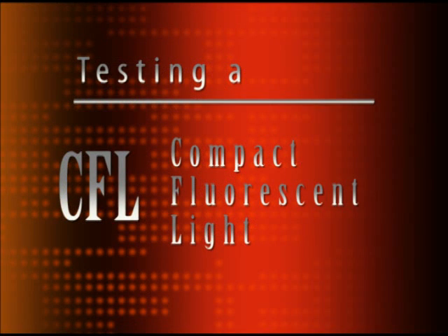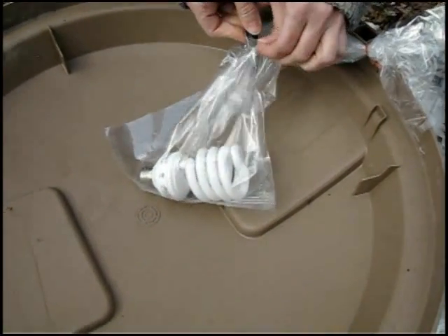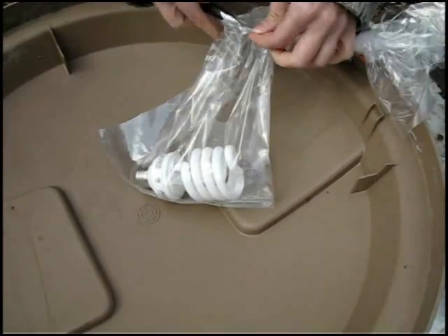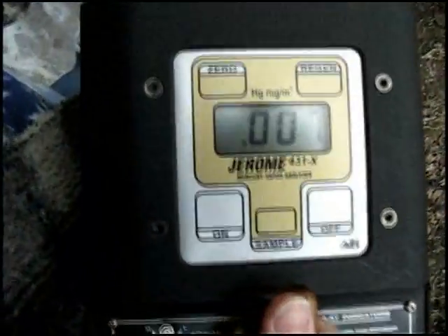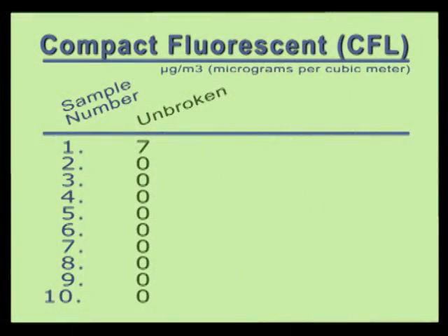Next, we tested a typical compact fluorescent bulb that we again purchased at Home Depot. We wrapped the unbroken bulb in plastic and then poked a hole in the bag, just as we did with the previous bulbs. Then we took our first reading. This time, we got a reading of seven micrograms of mercury vapor. We then took a total of ten readings inside the bag with the unbroken CFL bulb. All readings except the first showed zero micrograms of mercury vapor.